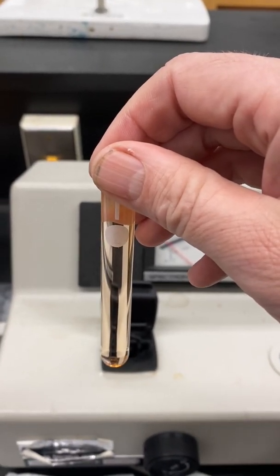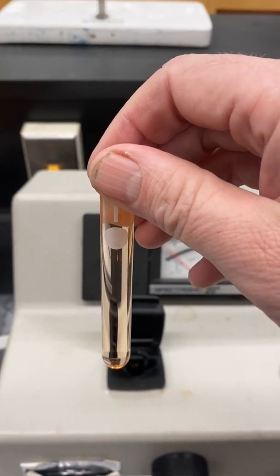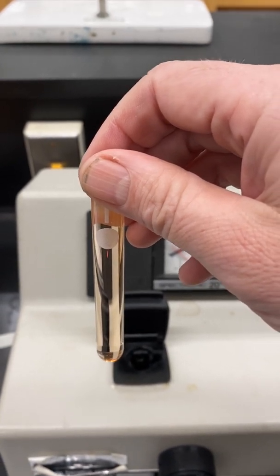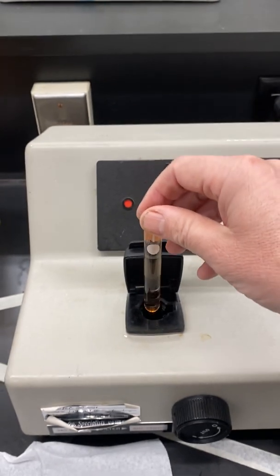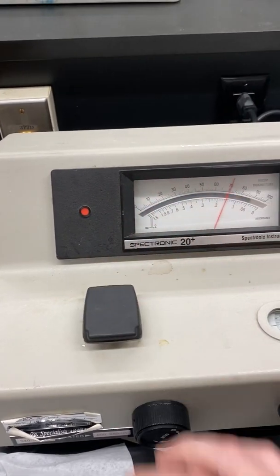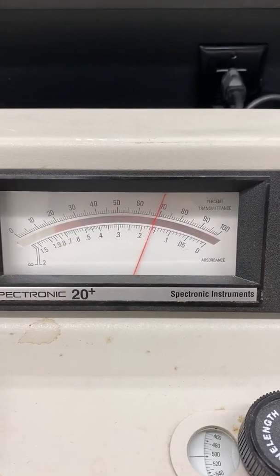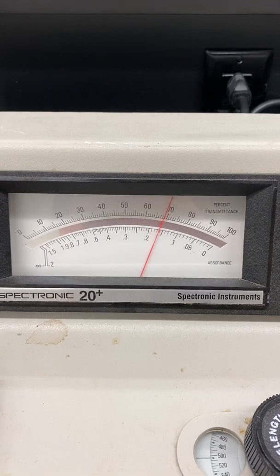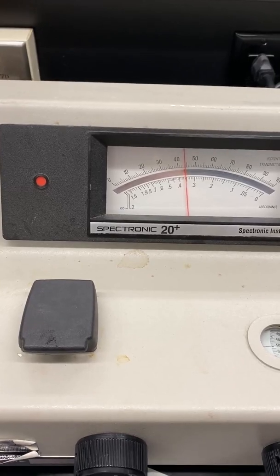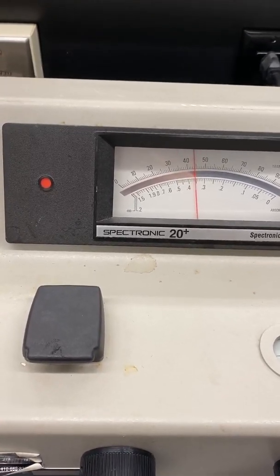You will now want to read the percent transmittance, which is on the top scale. Dump out the cuvette in the sink. Condition with a little bit of solution B and dump that out in the sink. Then fill the cuvette with solution B up to the circle, wipe off the outside with a Kim wipe, and — keeping the stripe toward the front — place it in the sample compartment. Record the percent transmittance of solution B.